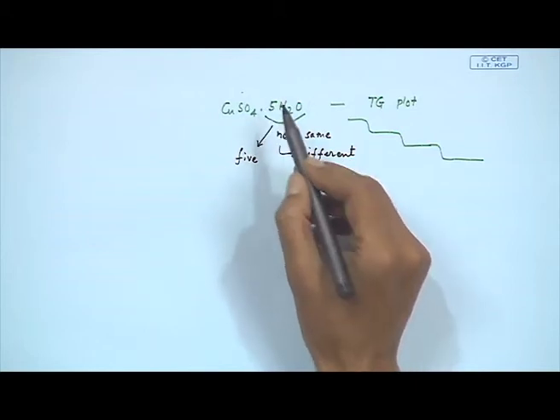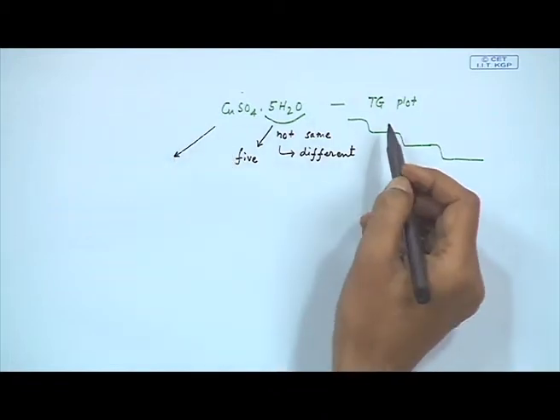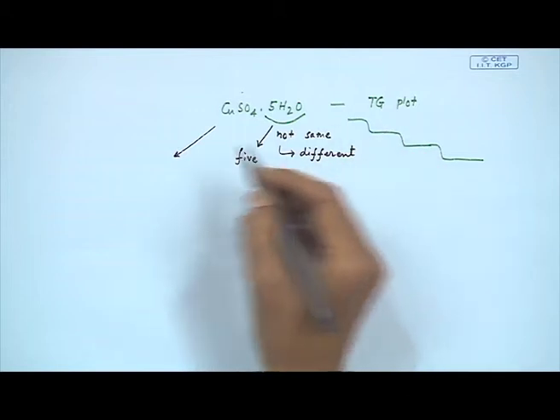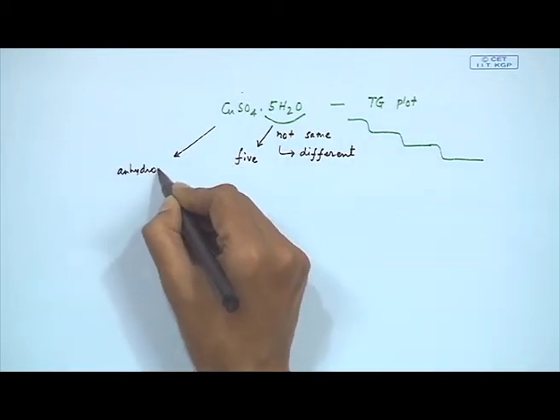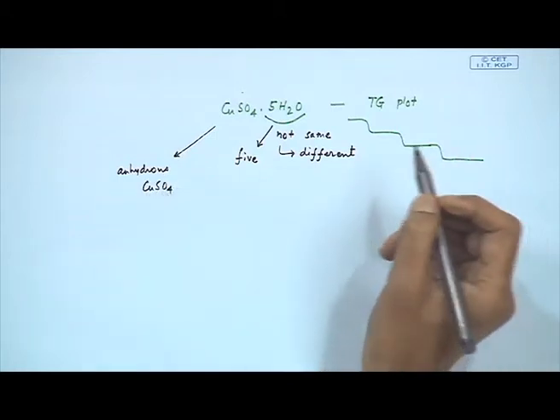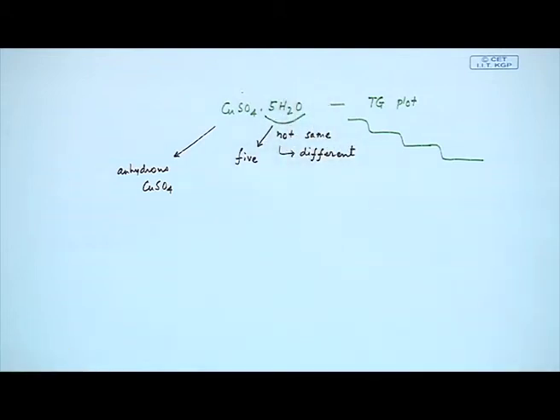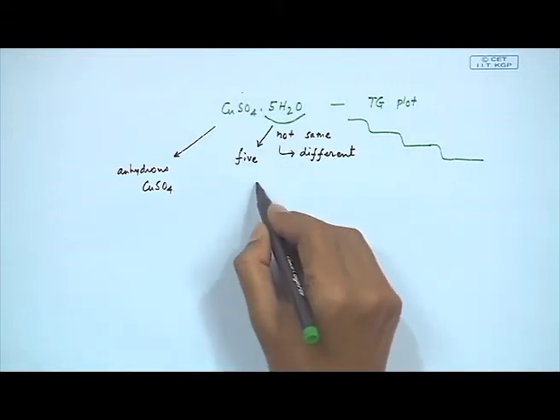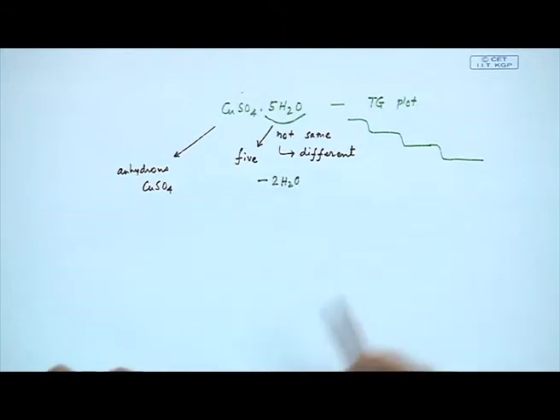What you expect, if we go like calcium oxalate or magnesium oxalate, that is, as typical anhydrous copper sulphate, is that if all 5 water molecules are eliminated in a single step, we should go from the copper sulphate pentahydrate species. But in the first step we have the loss of 2 water molecules.